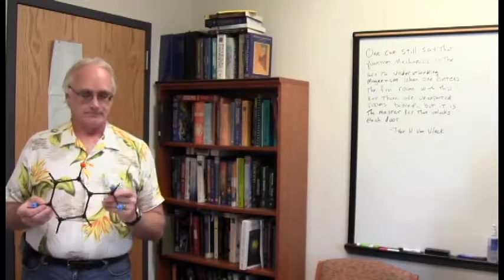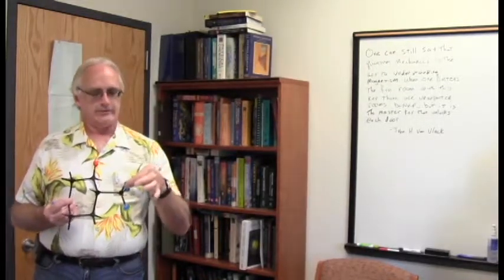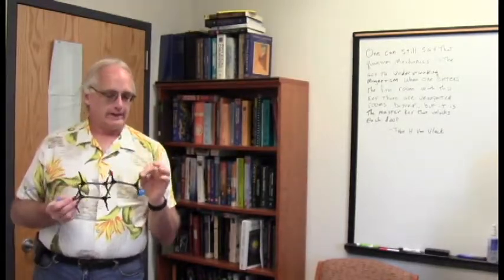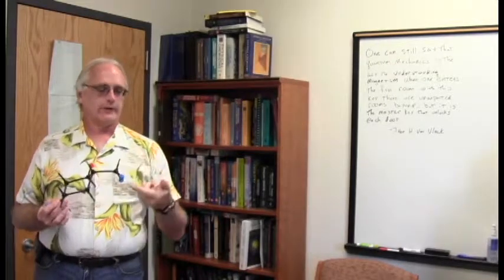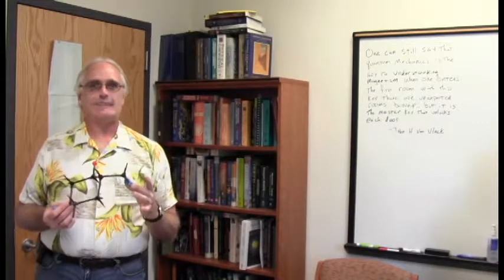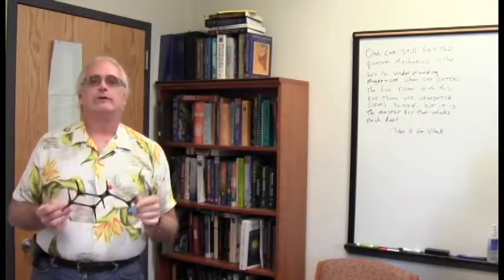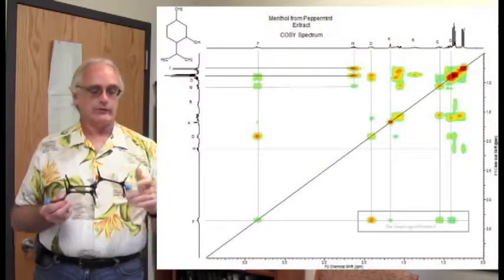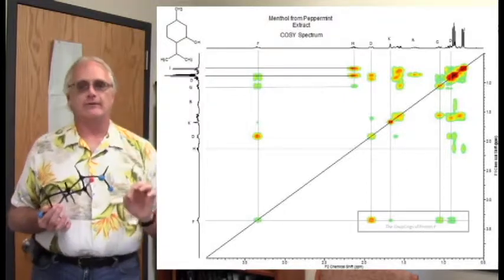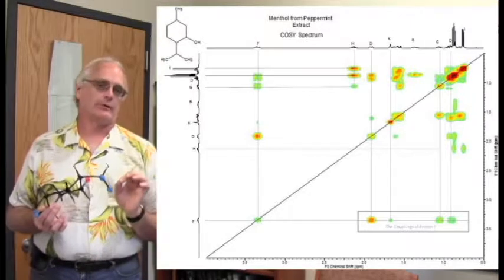Now the methyl groups. I'm going to use our dear friend the COSY spectrum and position H here, the septet of doublets. This is the one we know quite well, and use the COSY to step over to the two methyl groups that it's coupled to, the ones that are giving the septet appearance to position H. And it's kind of interesting if you look at the methyl groups in here. There are three of them, and you'll notice that they're all clustered together, but one is separated from the others. One's a little over 0.7. The other two are pretty much over the top of each other at 0.8.